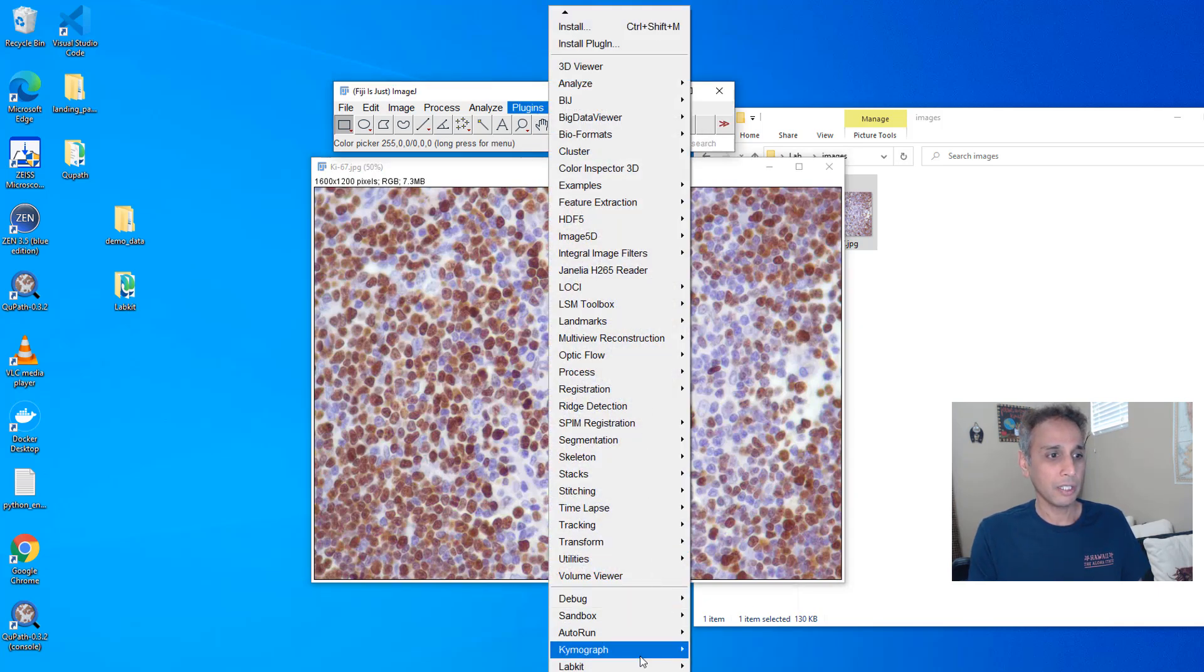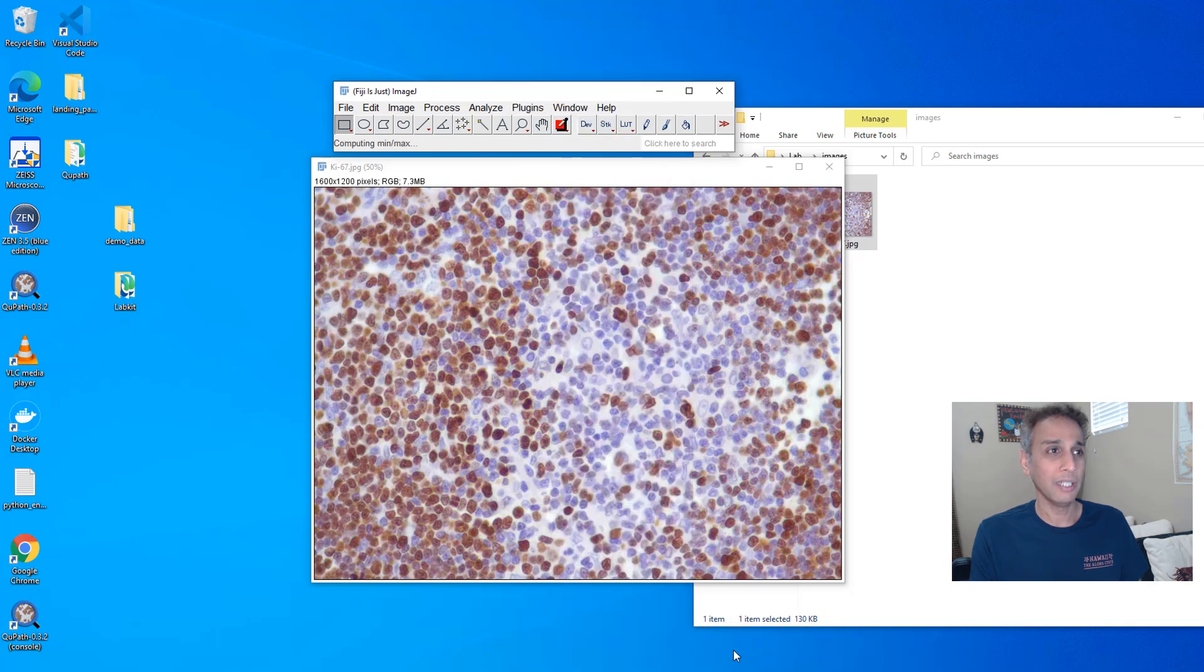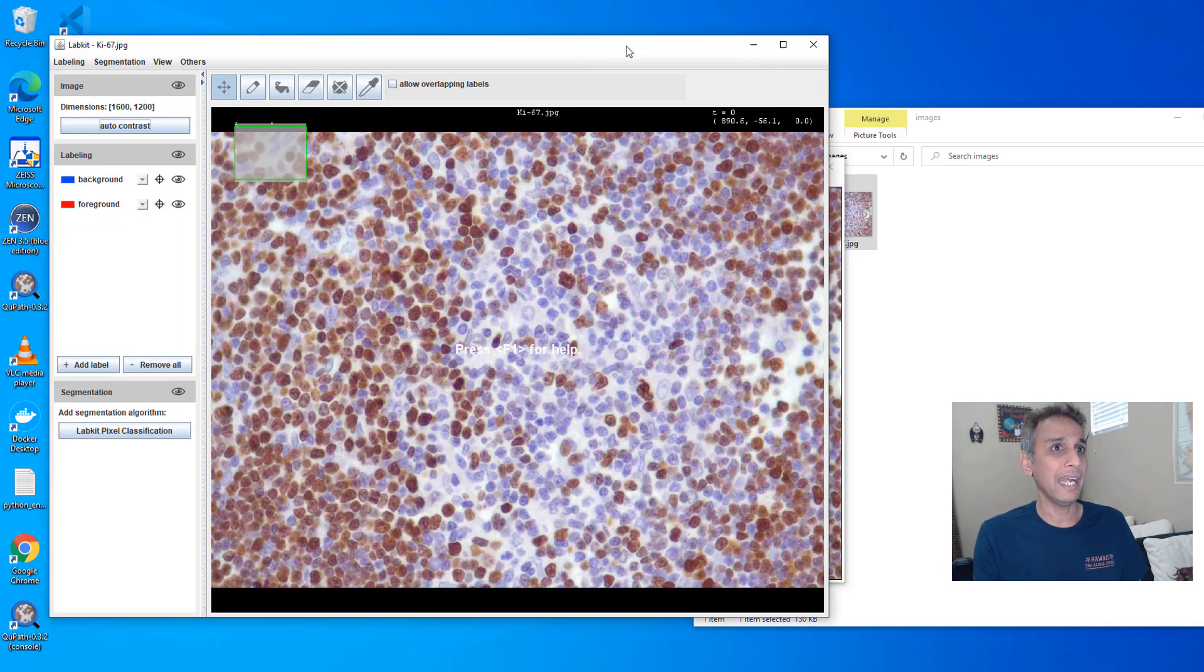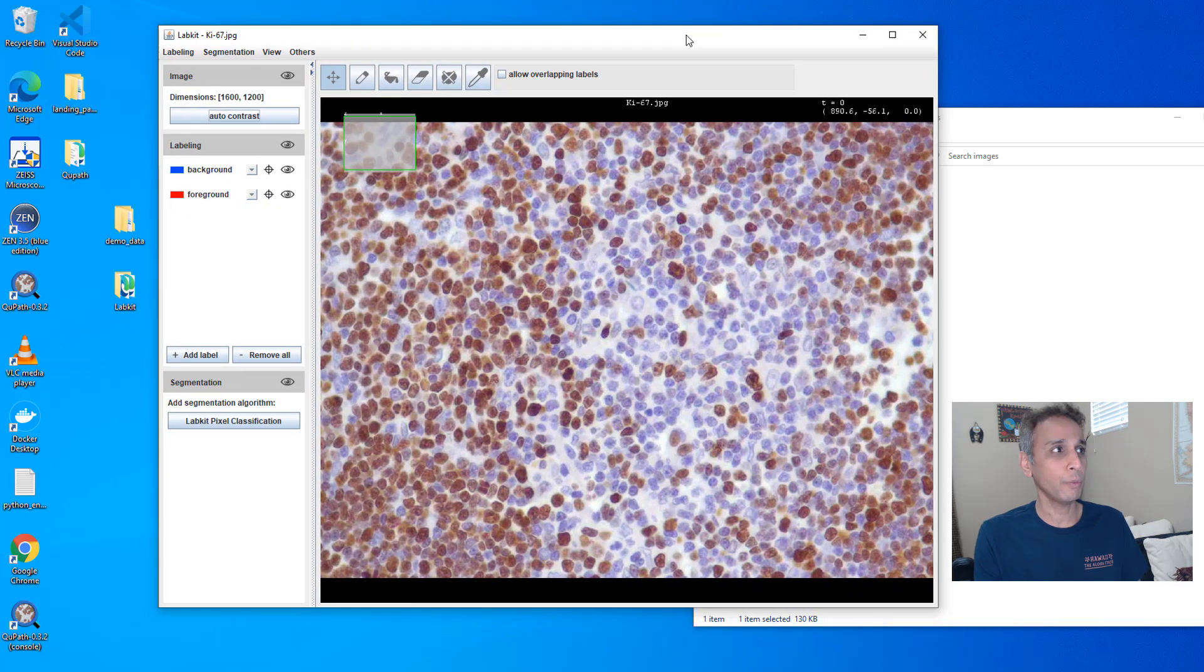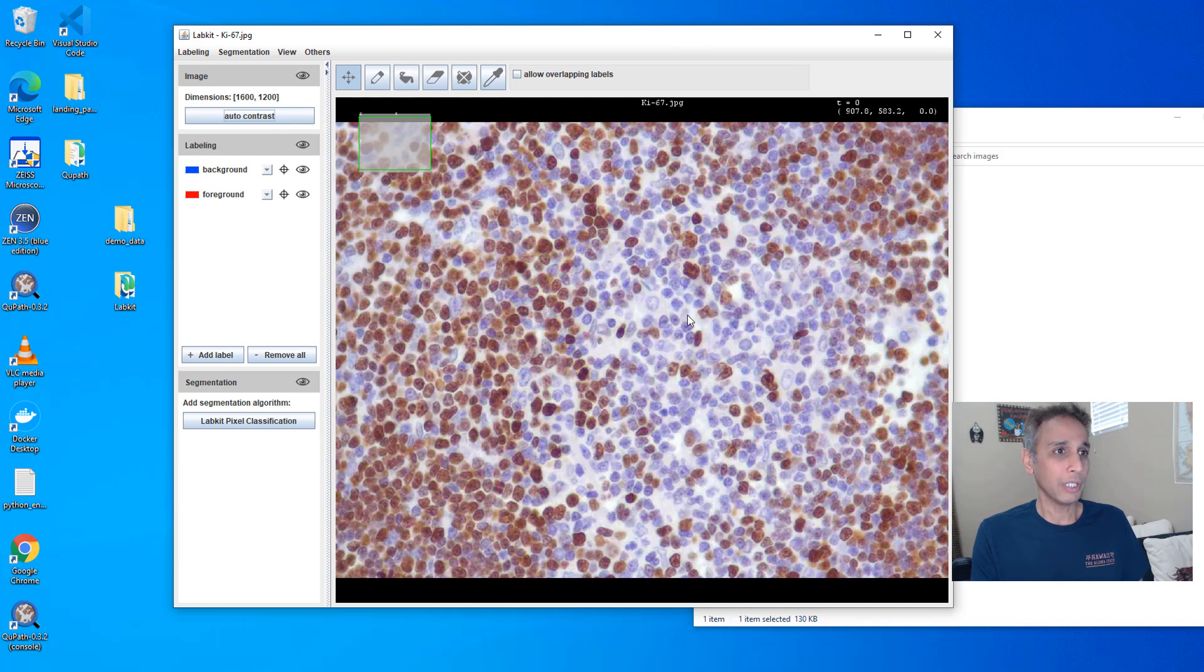So how do we get the process started? Plugins, LabKit, open current image with LabKit. So it's going to open that plugin, you'll see that in a second and there you go. I'll digitally zoom in so you can focus on this without all the clutter in the background. So this is the interface that we're going to work with.